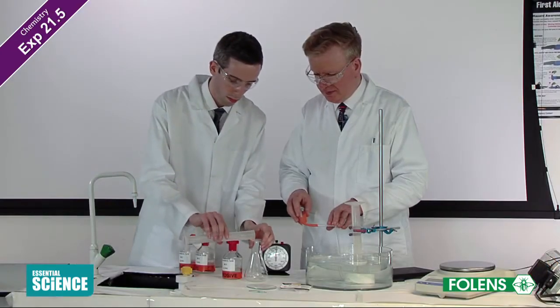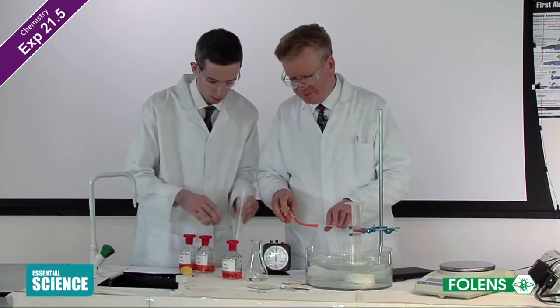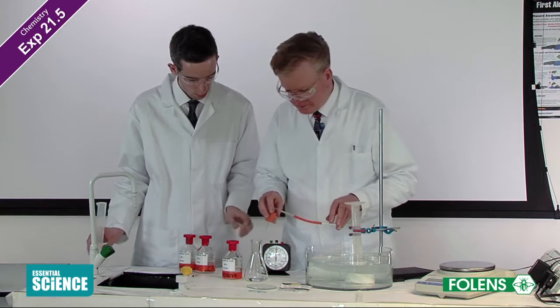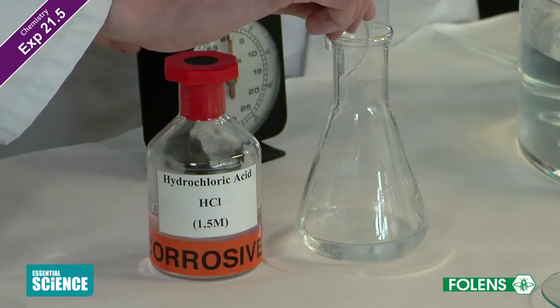Repeat the experiment using the same mass of magnesium metal but use 1.5 molar hydrochloric acid. That is, use acid having 3 times the concentration of the original acid.